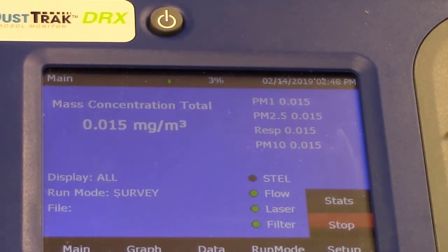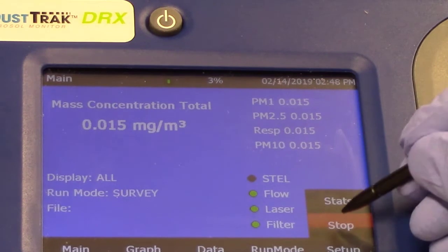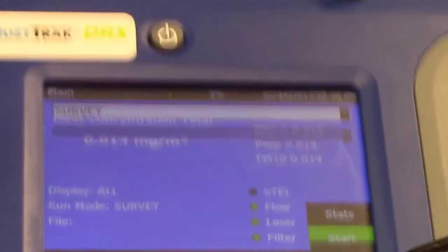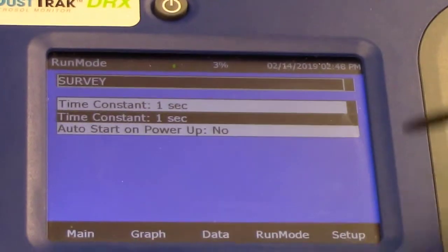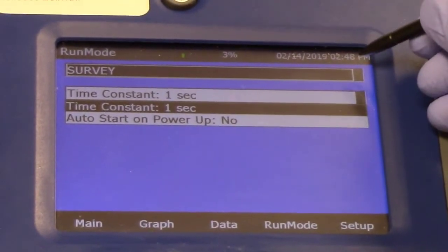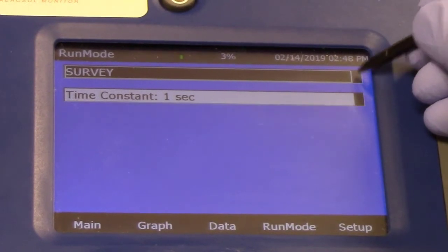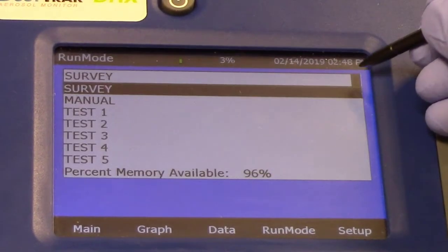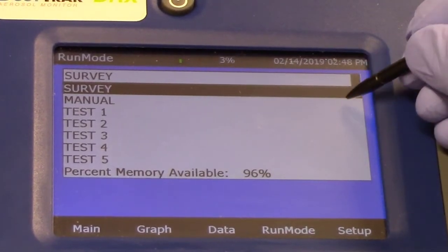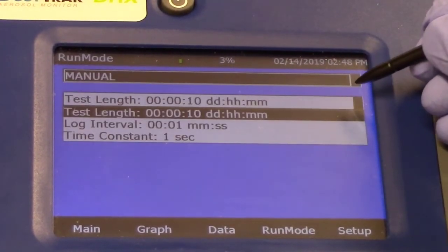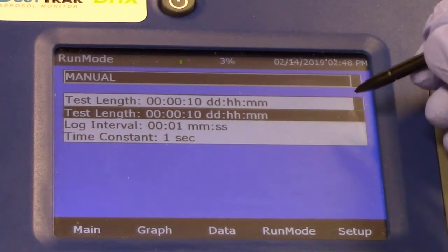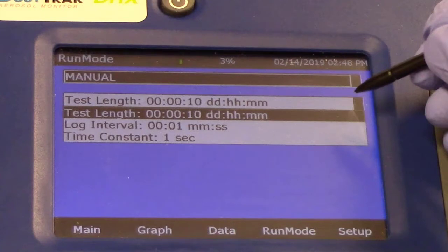We will be changing the run mode for this particular sampling. For our run mode, we'll be using manual mode so that we can input our preferred settings. In this illustration, I will be sampling for 10 minutes. Five minutes for taking sample background measurements, and five minutes to take measurements upon pouring of the cat litter.